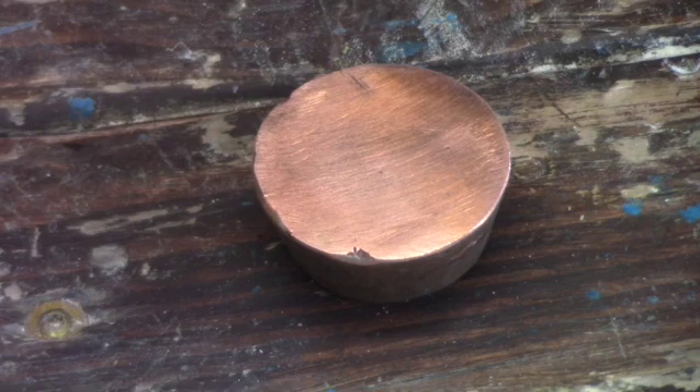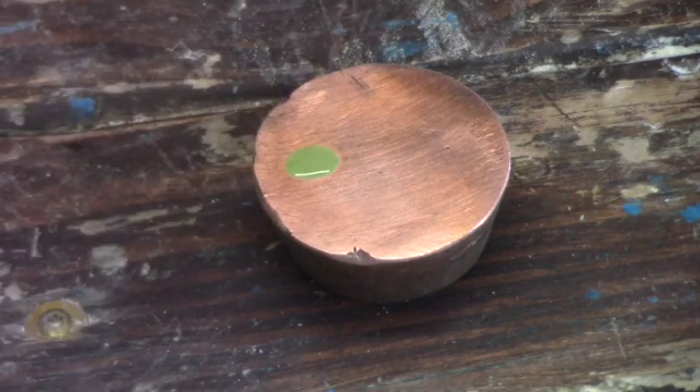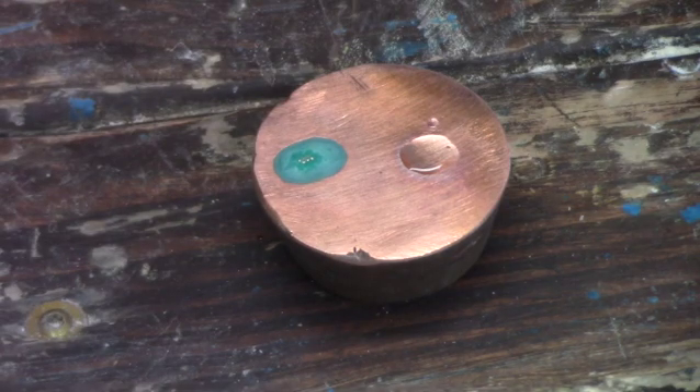I'm going to put a drop of nitric acid on this copper and you'll see that it turns green, which indicates that the copper is being dissolved by the nitric acid. Next I'm putting on a drop of hydrochloric acid, and you'll take note that it's not doing anything.